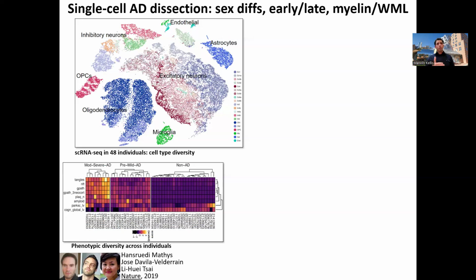So you've now clustered your cells, and at some point, you're going to call individual clusters, and you're going to give them a name. And you're going to say, well, these cells here that have the same barcode cluster together, and I'm going to guess that they have a particular identity. How? By looking at what are the genes that are the most expressed in those cells.